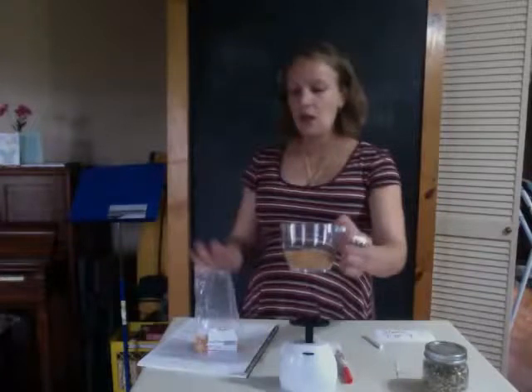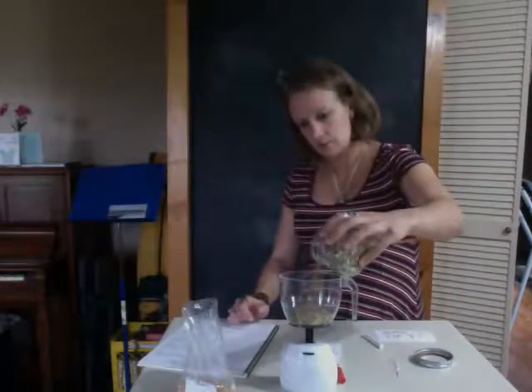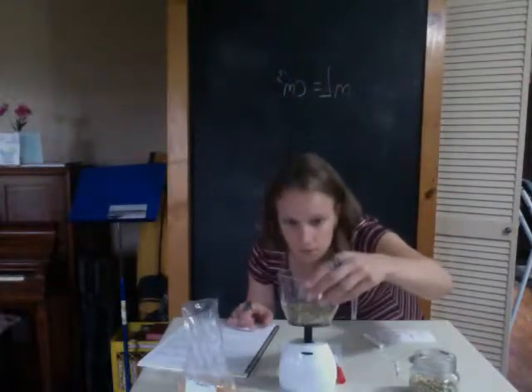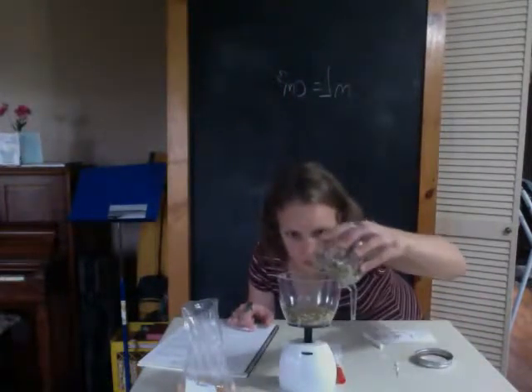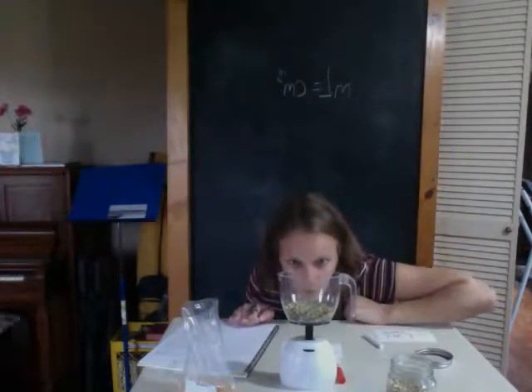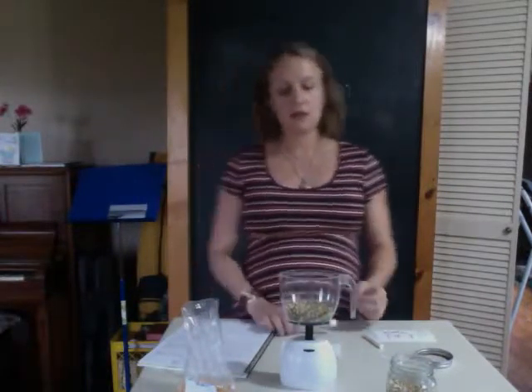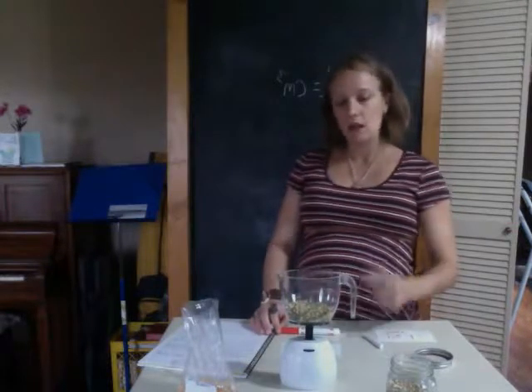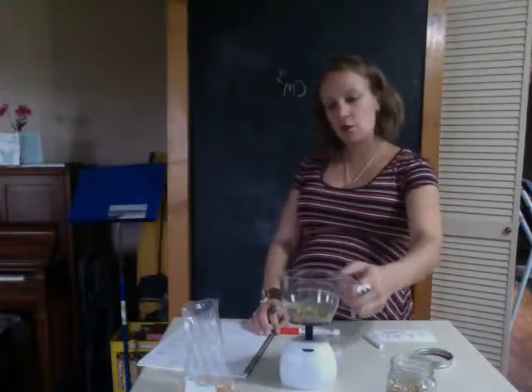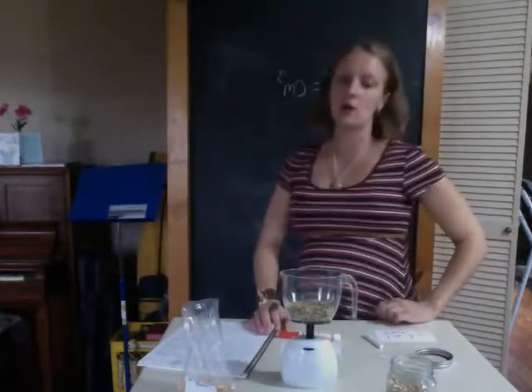So we're going to move on to the split mung beans. So I will measure out 100 milliliters. Okay, and it looks like I have 40 grams for the first sample. So if you're working with a scale like this, and you're working with solids, it's important to kind of level out what you have instead of keeping a mound there. That makes it easy for you to look and find out what volume you're dealing with.